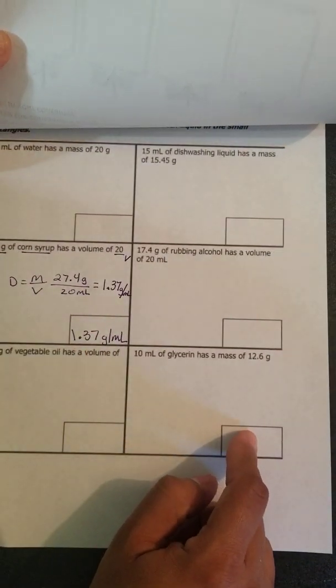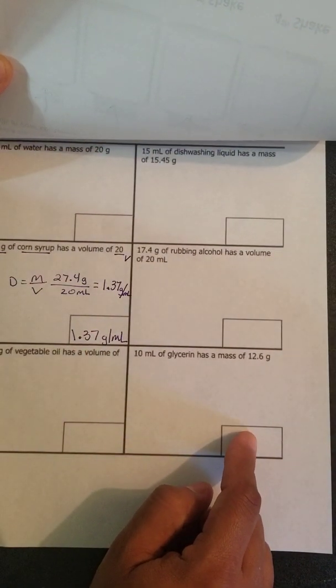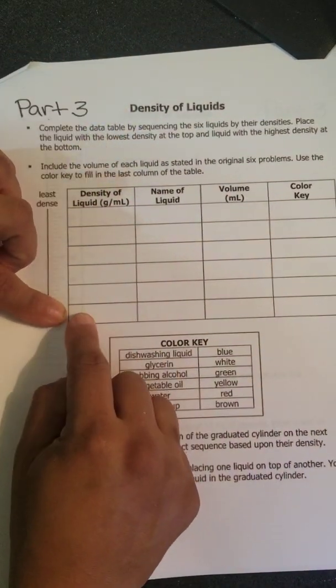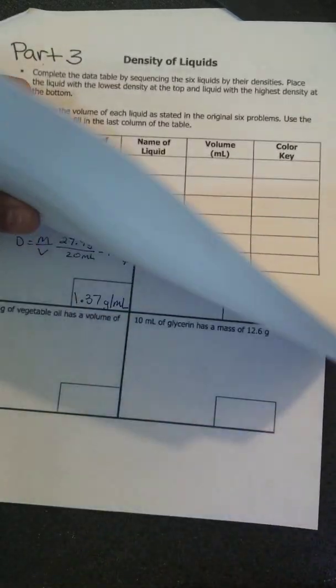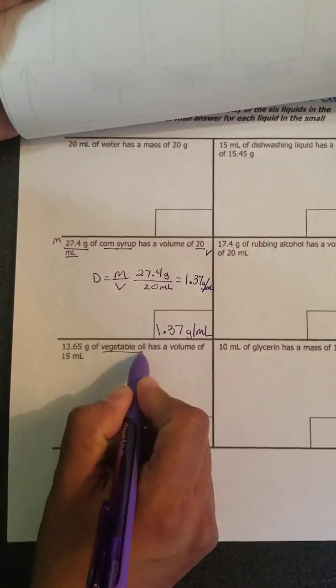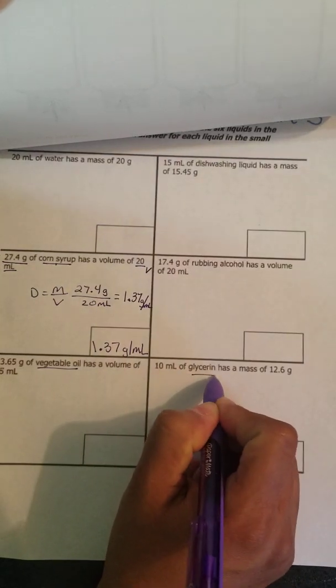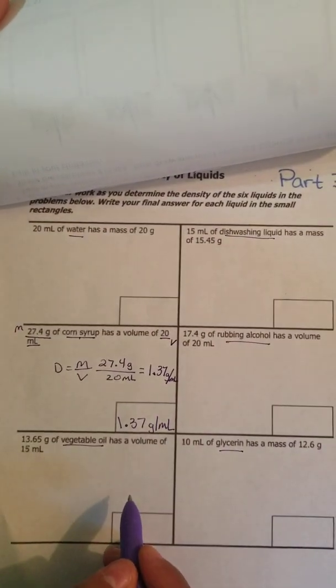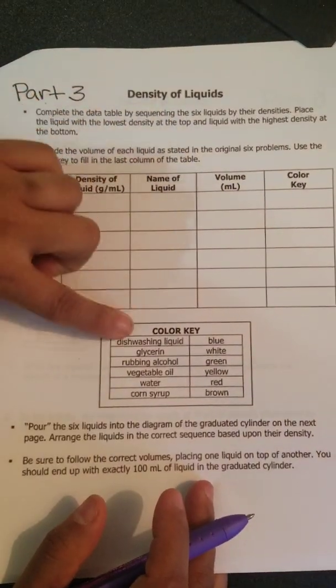You're going to find the number that is the biggest, and then you're going to go ahead and write that number here. You're going to write the name. Here are the names: corn syrup, vegetable oil, glycerin, rubbing alcohol, dishwashing liquid, and water. Those names are going to go here.